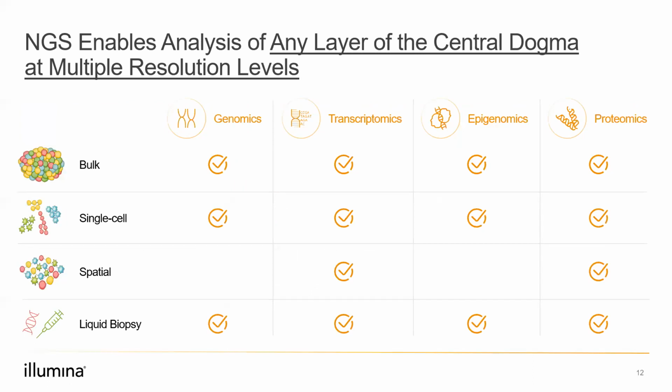So we have seen this incredible transformation of next generation sequencing technology. The unique capability of NGS applies unbiased discovery power to any level of cancer regulation and at multiple levels of resolution, positions cancer research for major future breakthroughs, both in understanding the fundamental aspects of biology and in enabling future therapies. So NGS has its origin in DNA and RNA-seq and has enabled comprehensive characterization of unique cancers because of its unparalleled capacity to remove the bias from research and capture characteristics that were previously unforeseen or even unexpected.